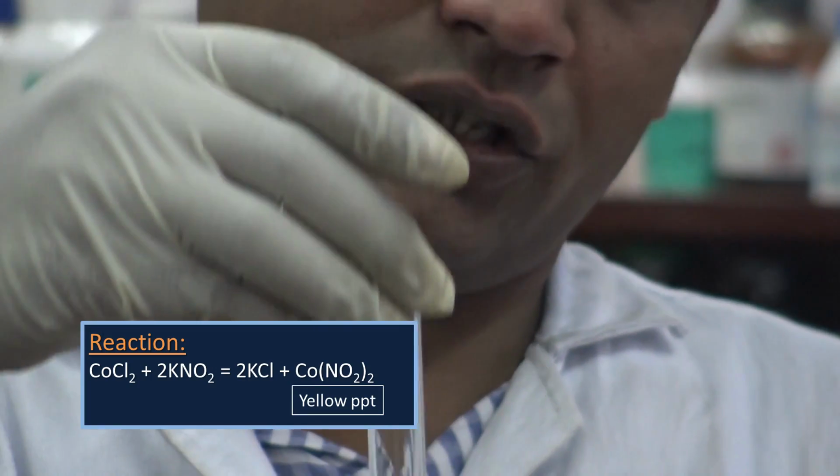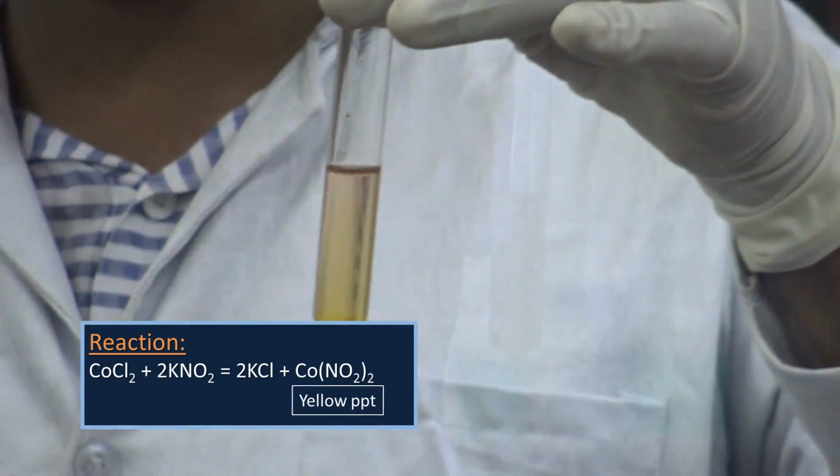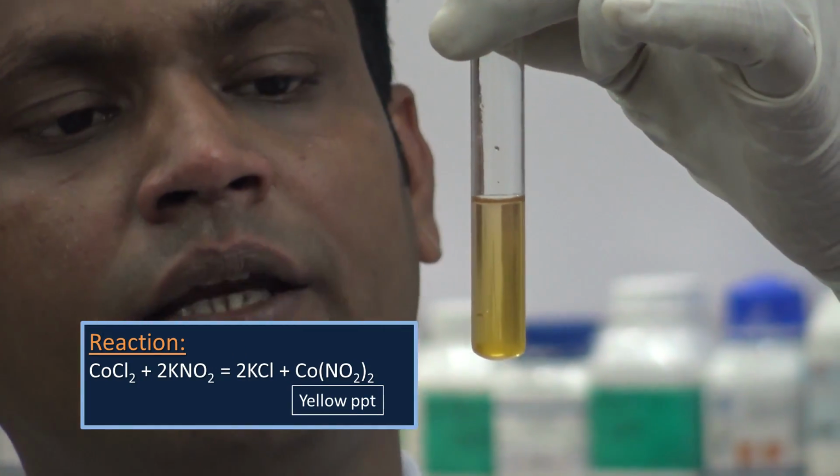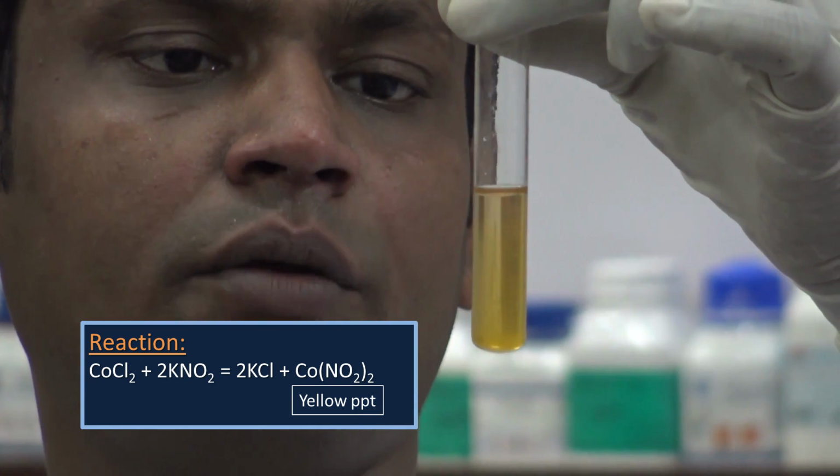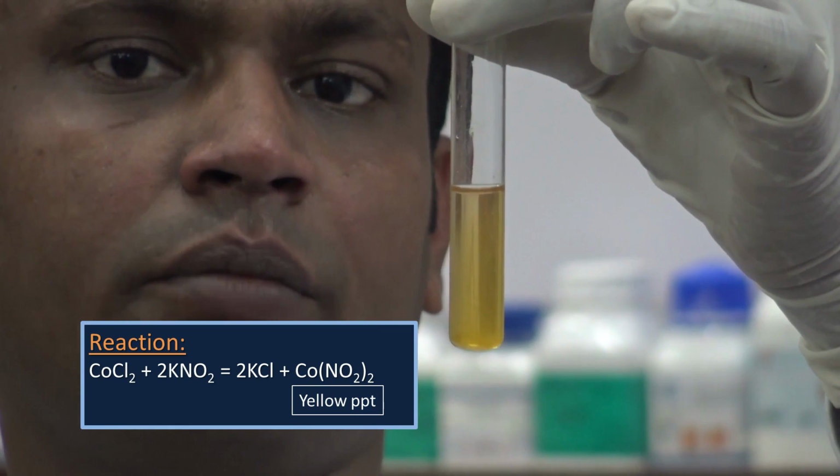Here you can easily see the color change. After a few minutes, the color of the sample solution becomes yellow. This formation of the yellow coloration confirms the presence of cobalt ion in our solution.